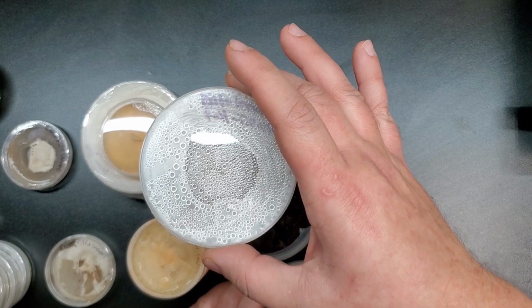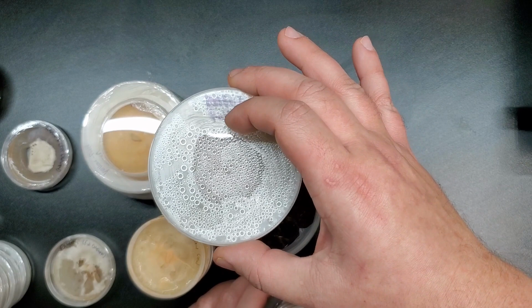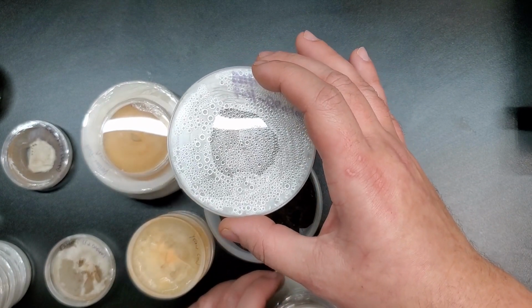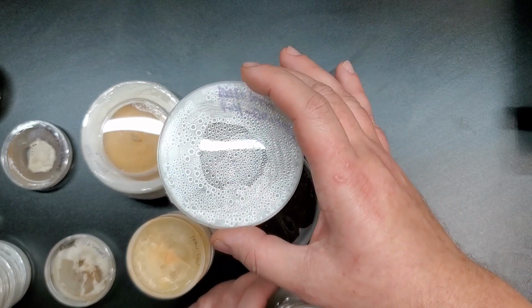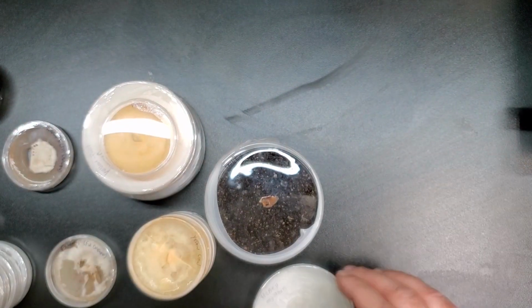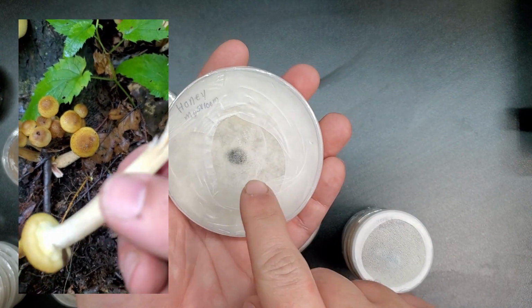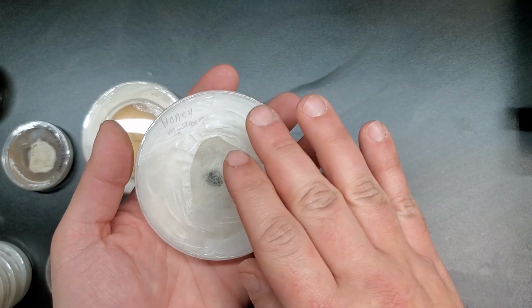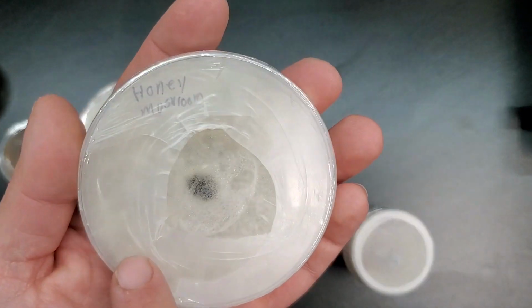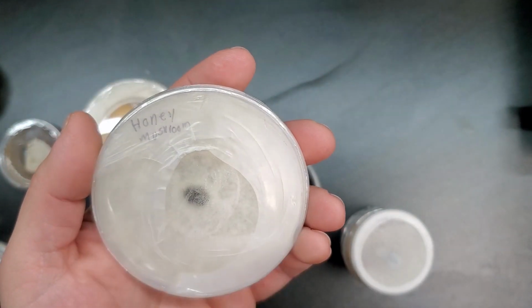This is a fully colonized 90 millimeter petri dish of the Entoloma fungal tissue. This is the fully developed one. I have it written there underneath this parafilm. This is going to go right into my refrigerator for my culture collection. So that's the main reason why this was inoculated. I just wanted to keep this one as a bulk sample for my culture collection. Here are all of the honey mushroom petri dishes. Once again, this is just a really large 90 millimeter petri dish that contains the honey mushroom tissue sample. It's fully colonized. I think you might just be able to make that out underneath the parafilm here and the condensation, which isn't too bad on this one compared to that other one, but still.